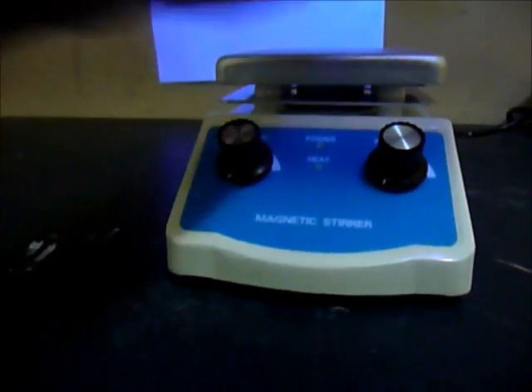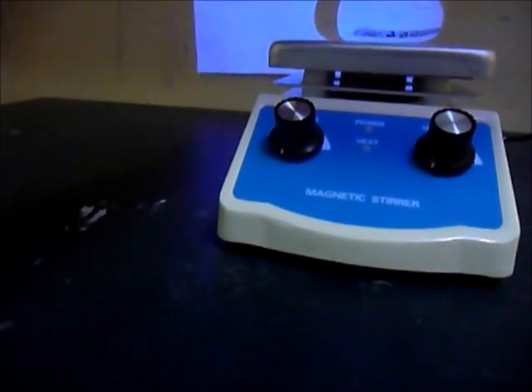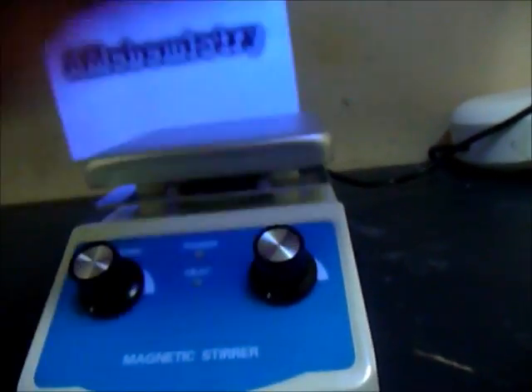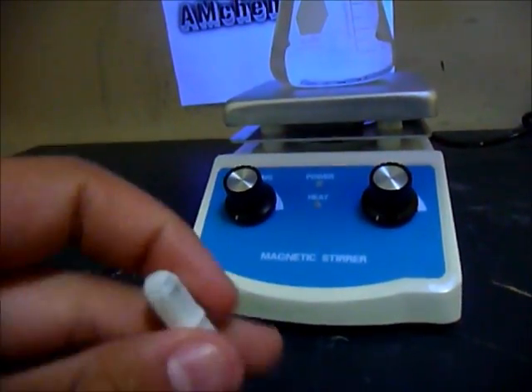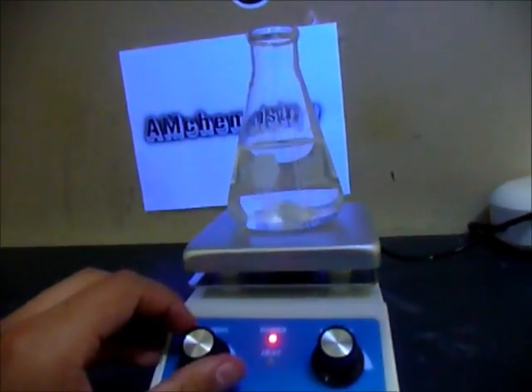You probably know that website already — that's where I buy most of my equipment. So right now I think it's like salt or something, because I was doing an experiment. This is pretty good — you use a stirring bar, just put it in there, and you stir it.